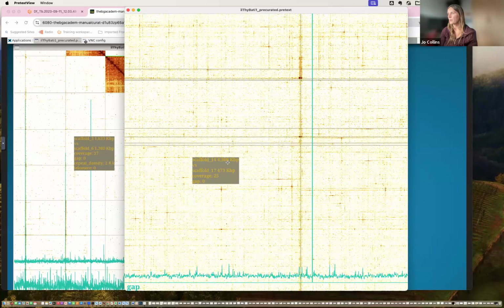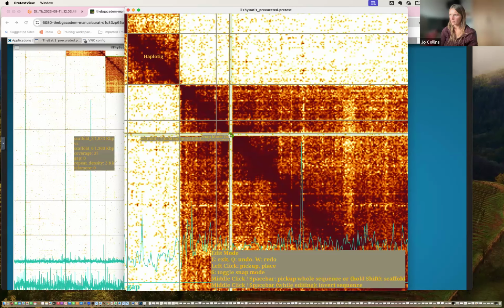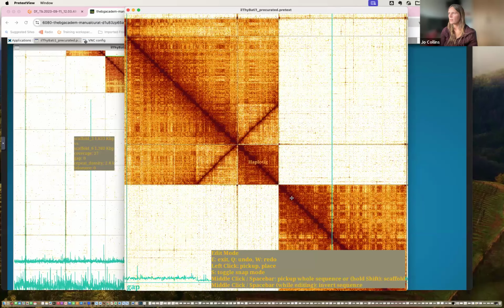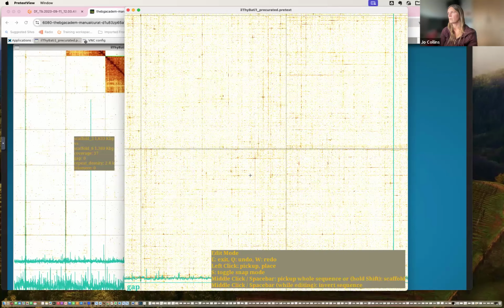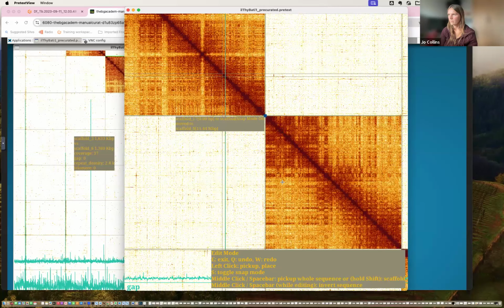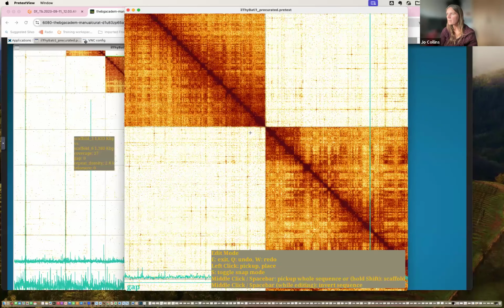There's a tiny piece, yeah. Okay, so on the end here, I'm going to remove my identifying tags. And you can see there's a tiny piece here with lots of white space, which is a similar thing that we had before. And actually, if you go up, I should have remembered which one it was. I'm just going to see where it was now. Actually, right, because I've confused myself as to where it is.